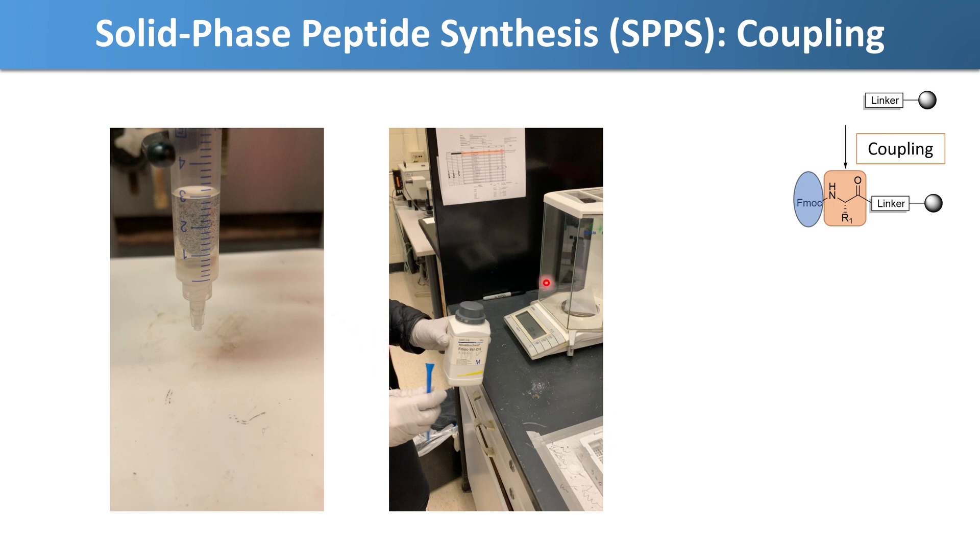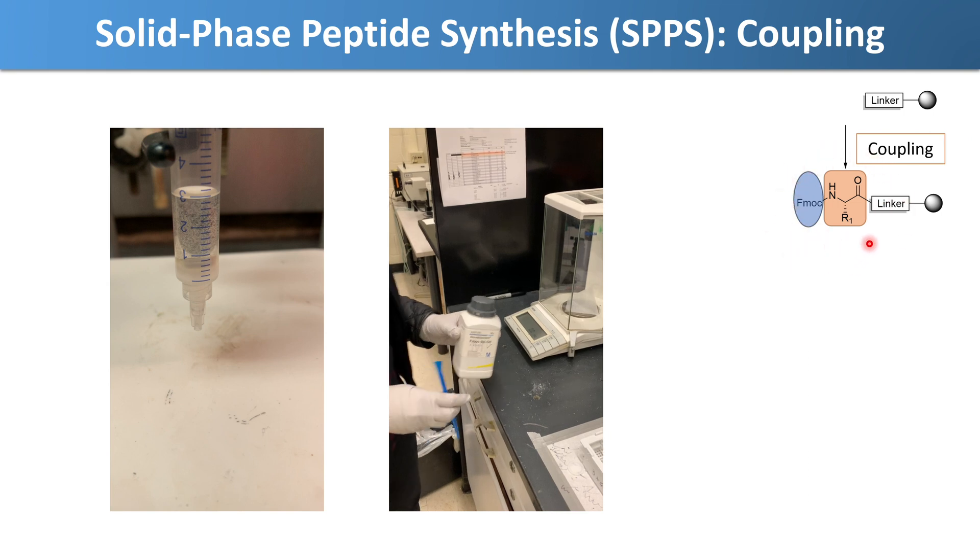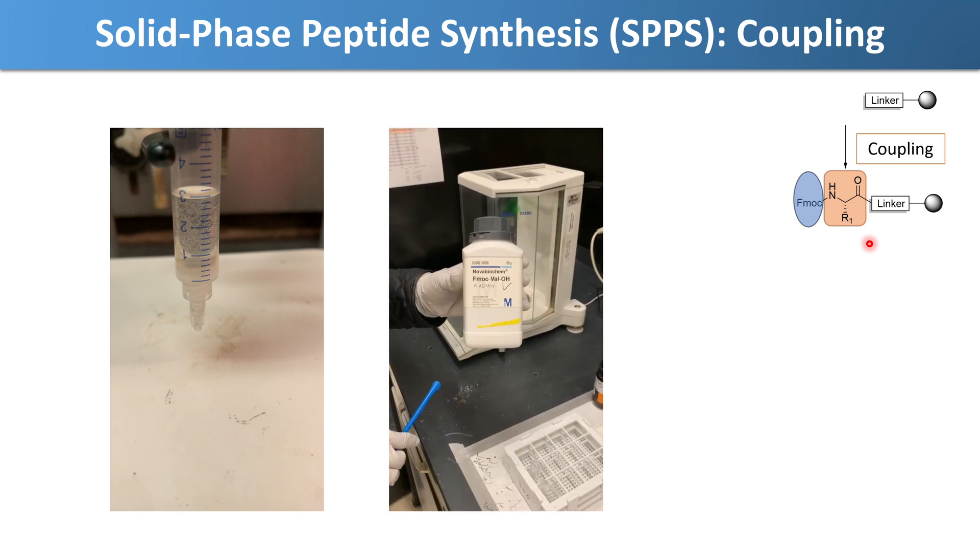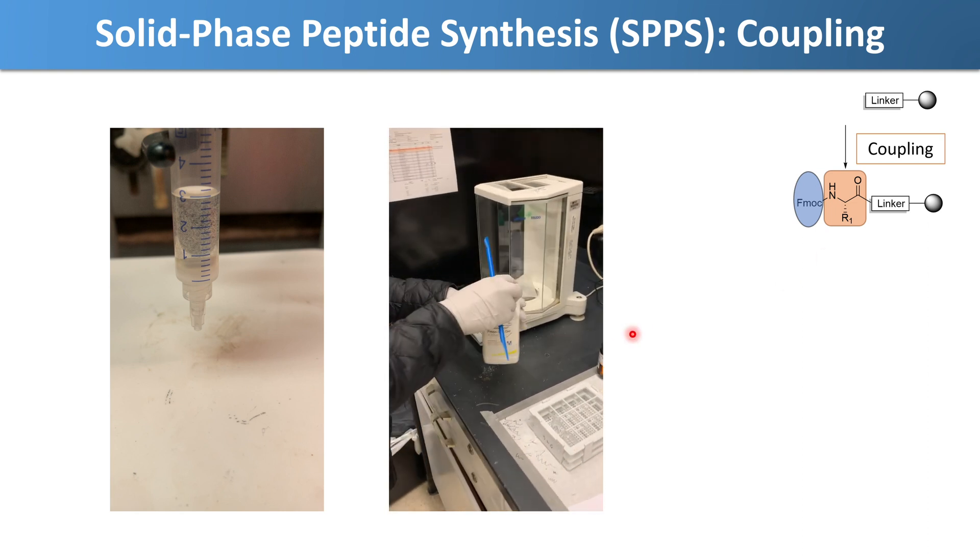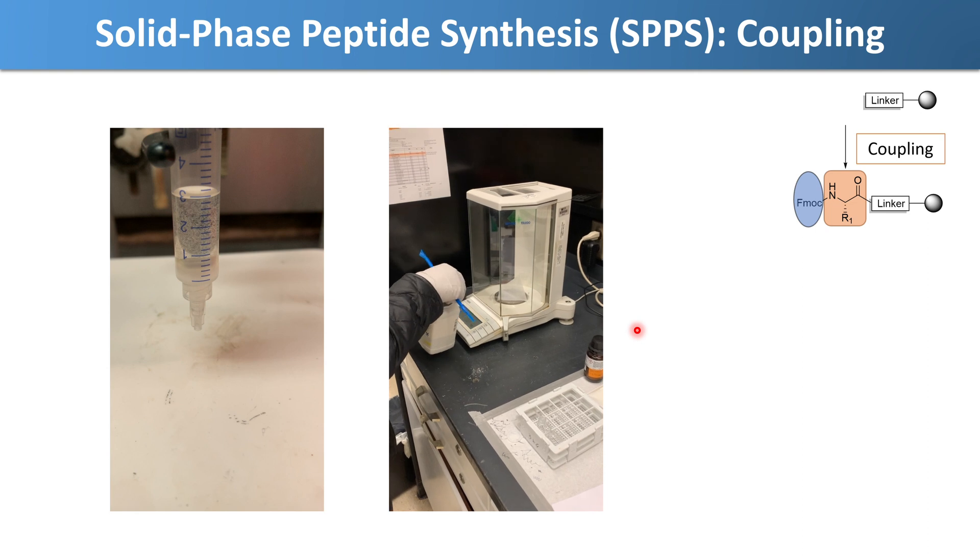This is going to be done virtually by Huangine. Her hands are going to be doing all the work in these videos. The first thing that we're ready to do is perform our first coupling reaction, and what this does is it adds on our first amino acid. Our amino acid in this case is valine, and first what Huangine is going to do is she's going to weigh it out.